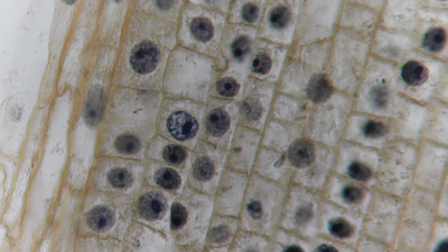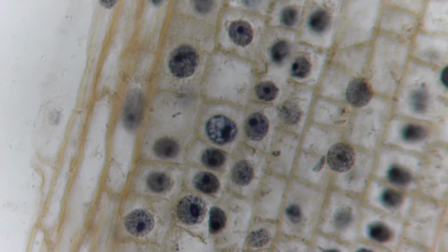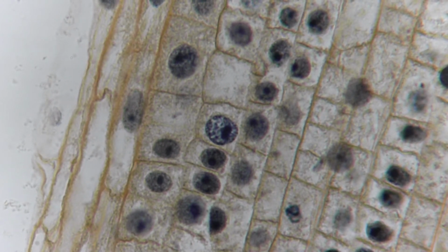I'm hoping you can identify it. It's not as picture perfect as the other one, but you see the one there close to center that you can see white space in it, and there's 4 interphases right below it.